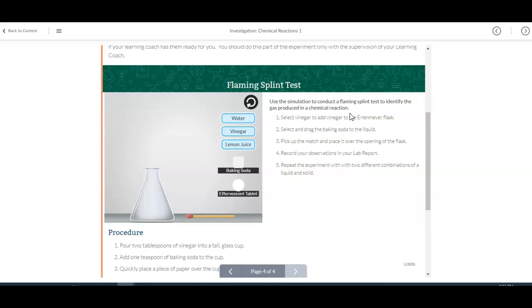I will say that in this lab, with the hydrogen gas, if the flame extinguished, there's just something not right with that. It really shouldn't extinguish because it makes the results of the splint test misleading. I'll go into a little more detail on that later.